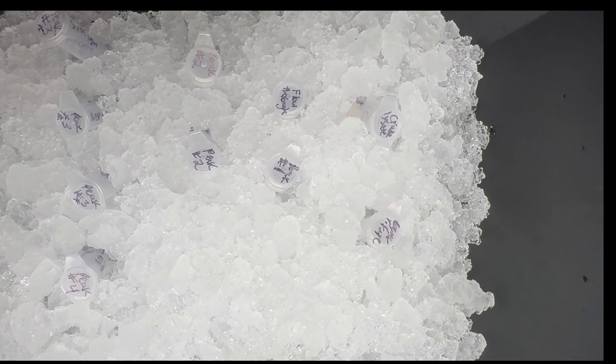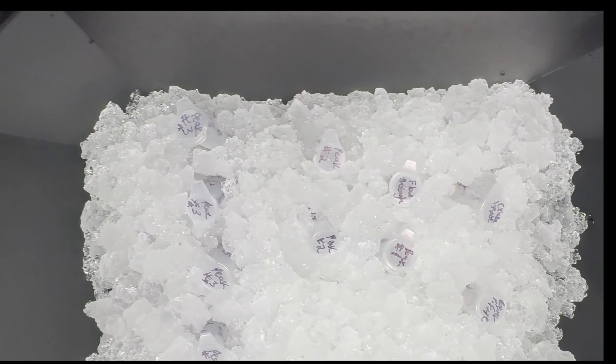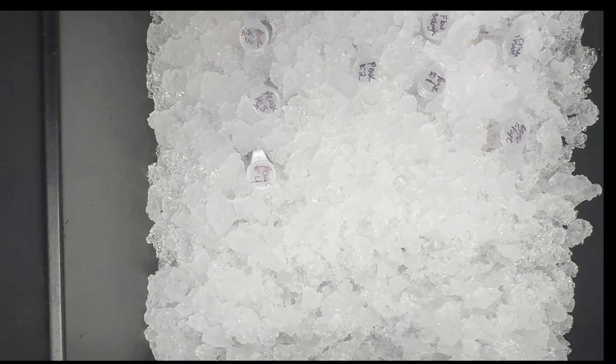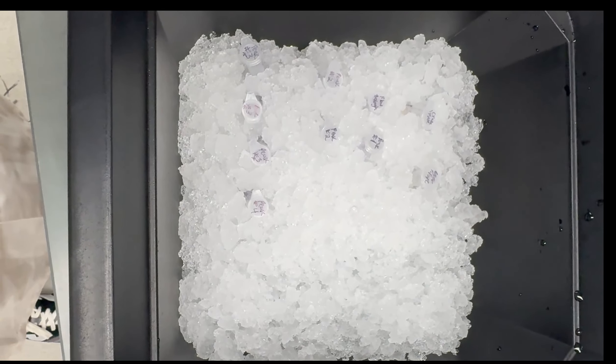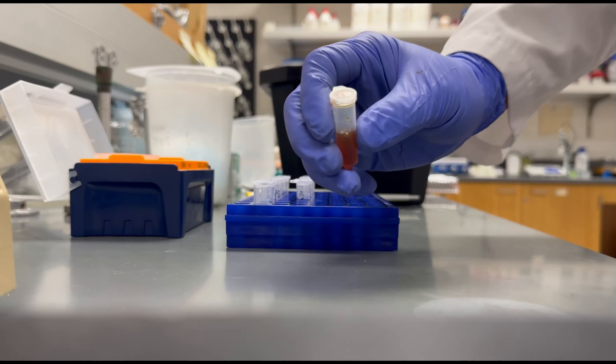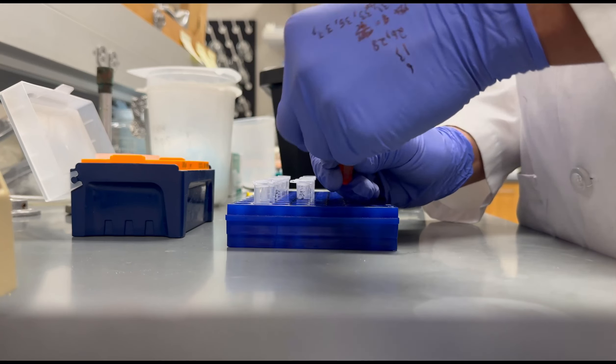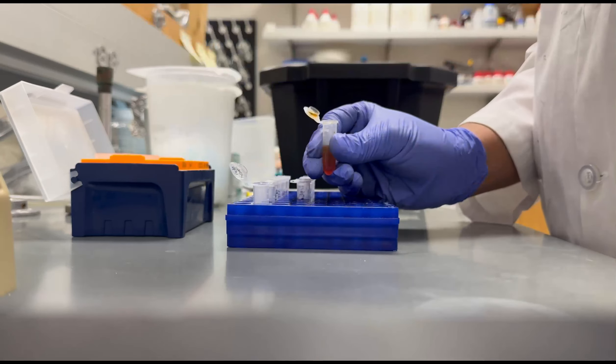To begin the procedure, you will need to take out your previously saved 30 microliter samples from each step of the purification process out of the freezer and begin thawing on ice. Each of these samples will be mixed with approximately 7 microliters of 5X loading dye. This dye contains SDS and beta-mercaptoethanol.